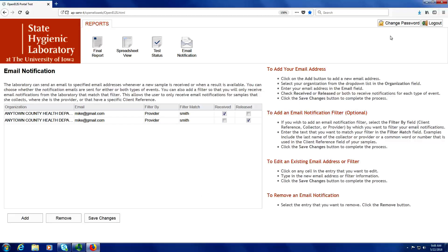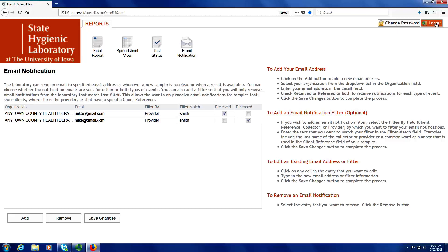Lastly, you can click on the change password button in the top right corner to change your password. When you're done using the OpenELIS web portal, it is important to log out of the system. This is especially important if you have clinical samples because those would contain protected health information.